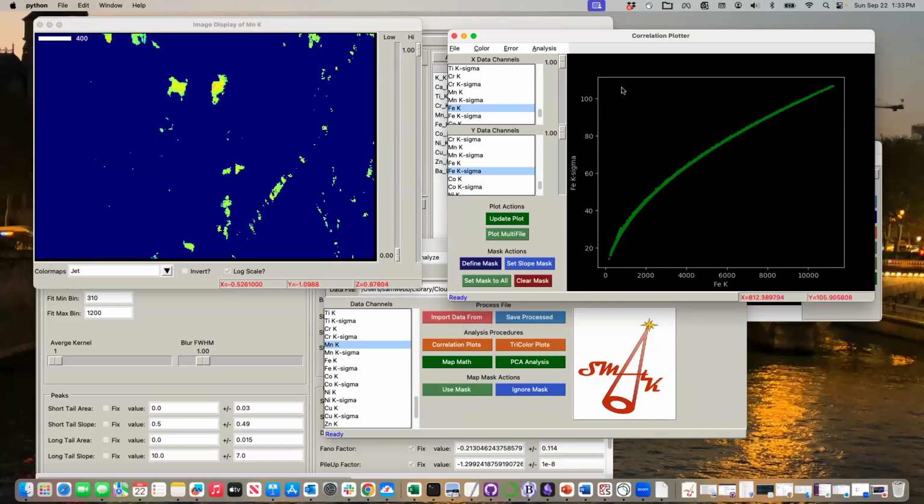If you can't see that on the line here, you can't do that in your head. I can't always do it. If you go to error and say, show me a square root line, there you go. So all our data follows the Poisson statistics. So we can trust all the iron data for the most part. That's nice. I like that.